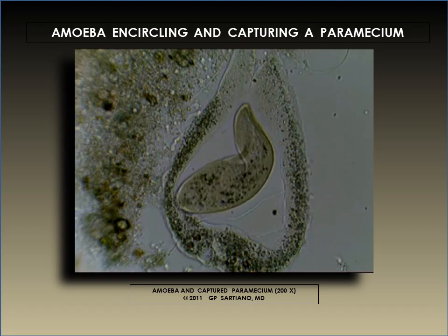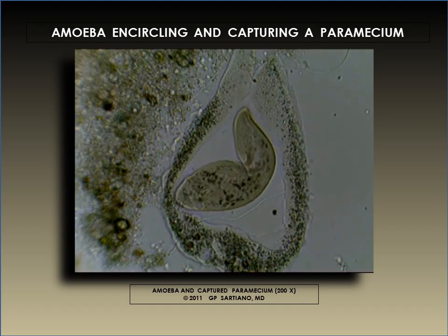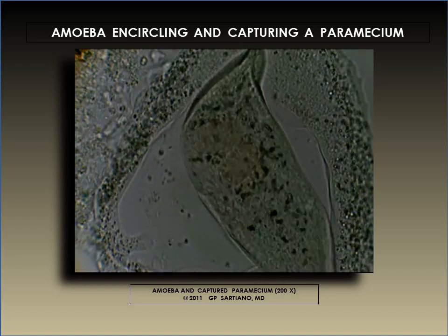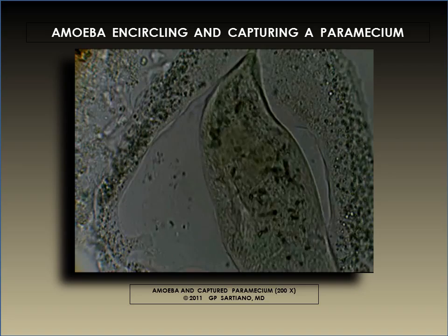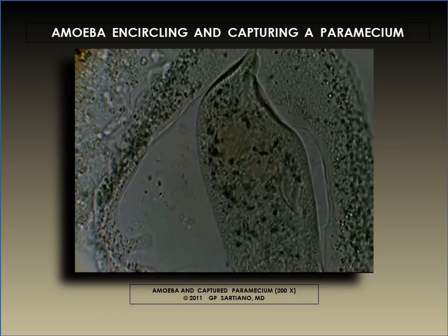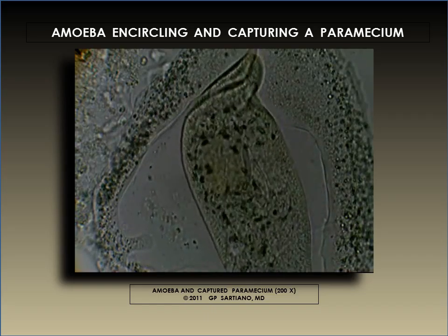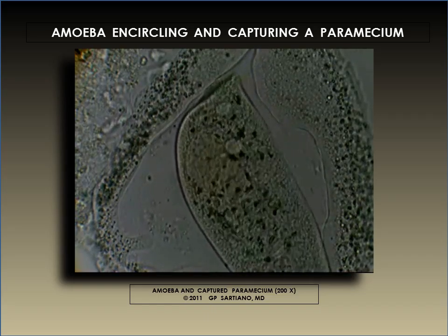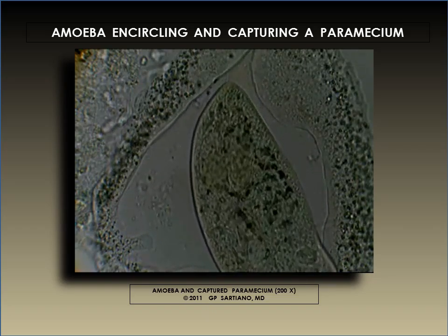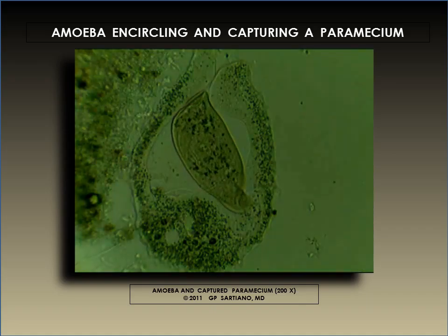The amoeba has trapped the paramecium and is slowly closing the loop of its body around it. Notice that the paramecium seems to sense the potential opening at the uppermost end of the loop, returning to it repeatedly. Eventually, the paramecium will exploit this discontinuity and will be able to extract itself from the amoeba's grip.